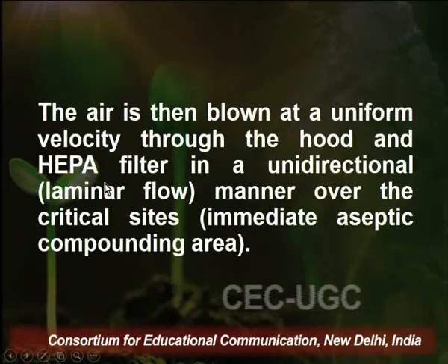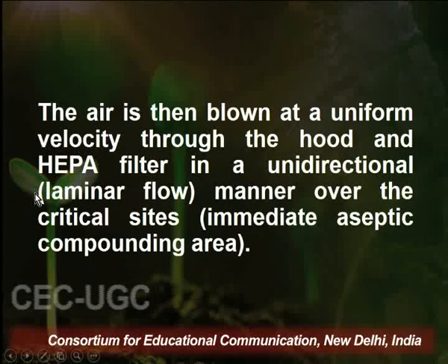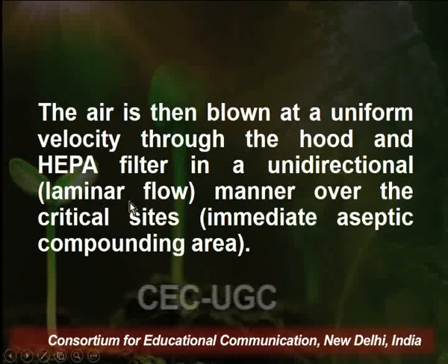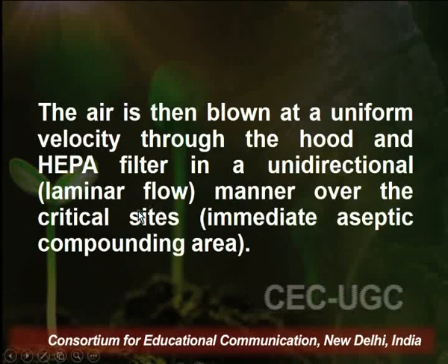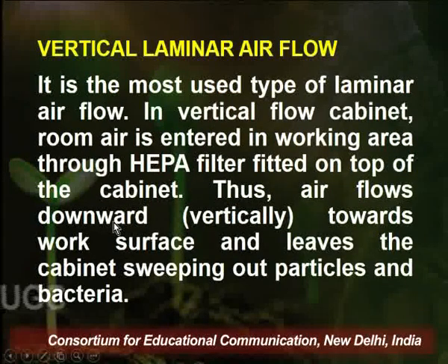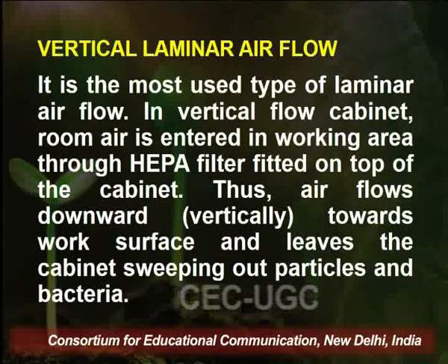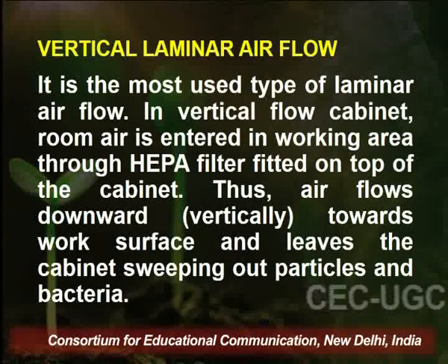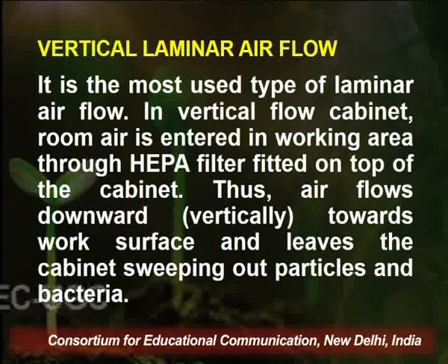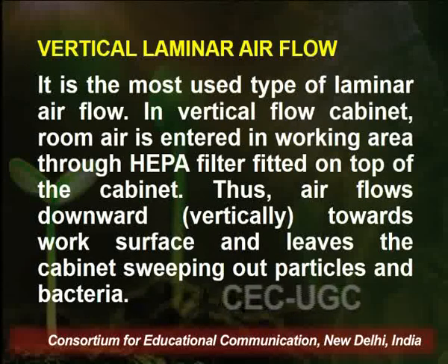So this unidirectional flow is all because of the unidirectional flow of the air. It is also termed laminar flow because the air flows in a sheet arrangement in one direction. There are two different types of laminar airflow which are very frequently used. One is called vertical laminar airflow. It is the most used type of laminar airflow.